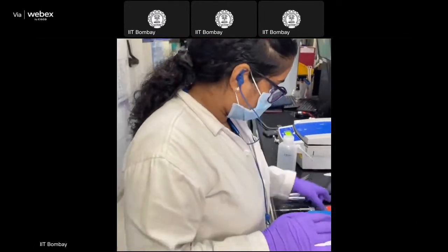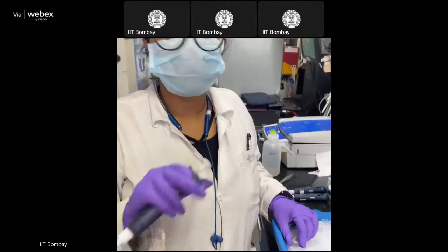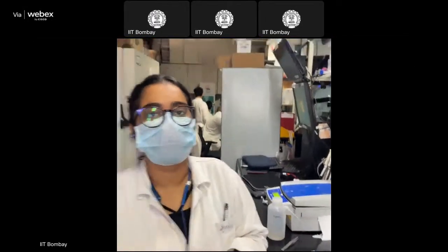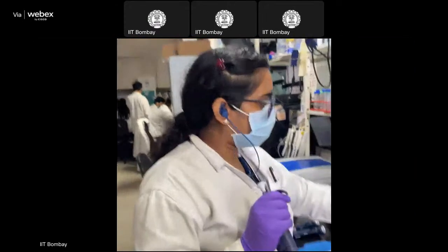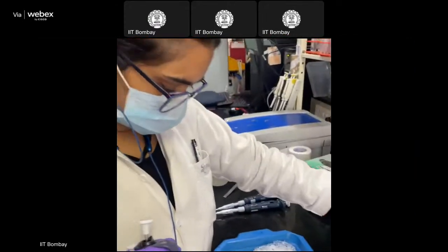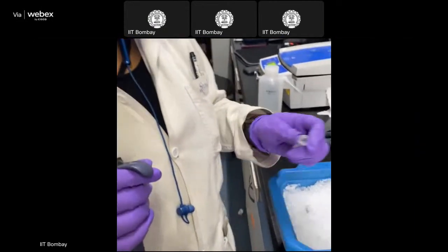First you need to prepare the sample. For that, you did the quantification. Now you can take 20 μg, 30 μg or 50 μg of lysate, whatever is your requirement. Then you make up the volume with the help of buffer B. After that, you add TCEP, as I have already mentioned.